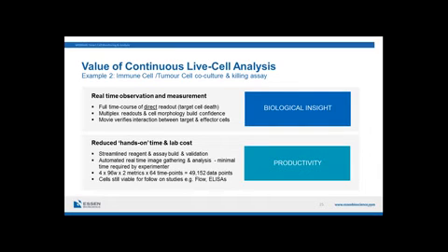Hopefully I showed you how we could streamline some of the reagent and assay build using this continuous live cell analysis approach. In the assay itself, we had 4 96-well plates with 2 metrics and 64 time points, so we analyzed 49,000 data points in this study.